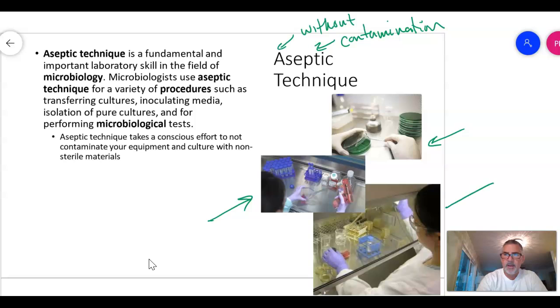And then we'll use things called laminar flow hoods. So a laminar flow hood takes air current from above, so there's air current coming down this way. That air current has gone through a HEPA filter, so it filters down to viral size. So it's essentially just clean, sterile air, and it blows down, past, and out the opening. So this air is flowing down, and it's flowing out the opening here.